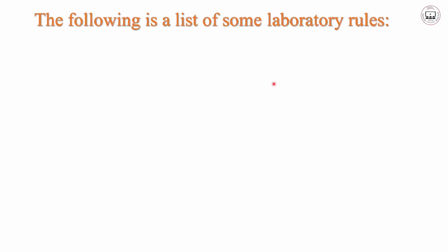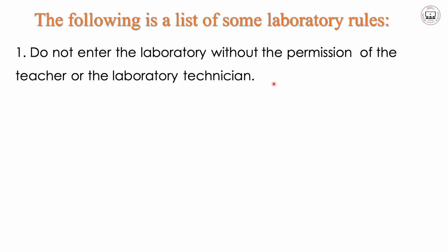Let us pay attention as we see these rules, because in the near future, as we go to lessons of biology, we are going to the laboratory and we need to know them before we go. Number 1, do not enter the laboratory without permission. Is that important? Yes. Do not enter the laboratory without permission of the teacher or the laboratory technician.